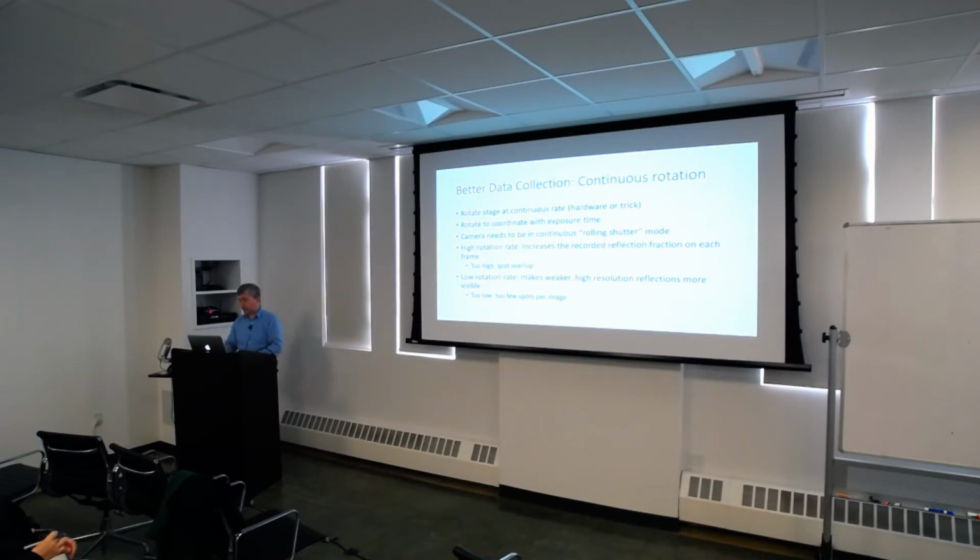And what they did, first of all, was on the Tecnai F20, there's an alpha button on the stage itself that lets you tilt it. The harder you press that button, the faster it tilts. So they came up with a little weight, and they put this little weight on it that weighed the exact amount to tilt it at the exact rate that they wanted. You can now buy something for the microscope that will let you do this continuous rotation.